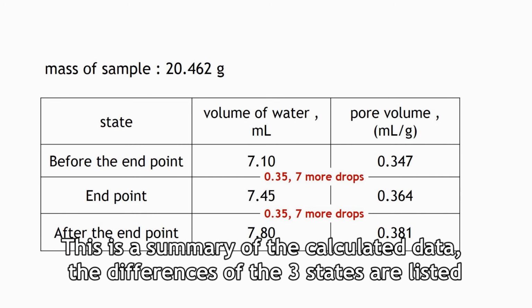This is a summary of the calculated data. The differences of the 3 states are listed.